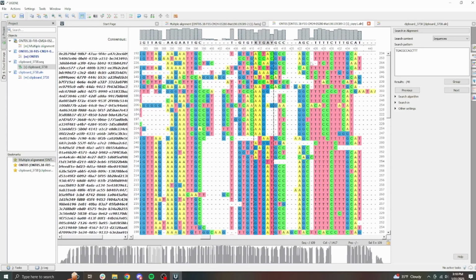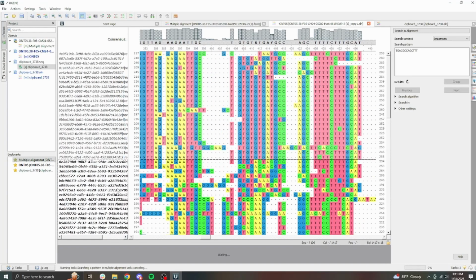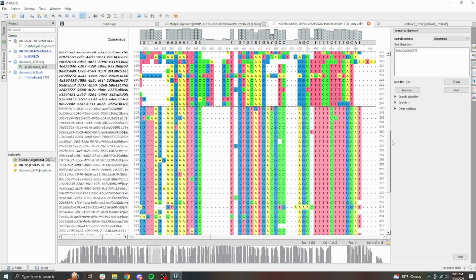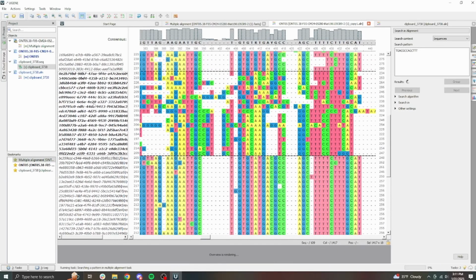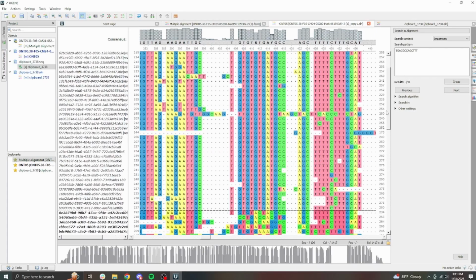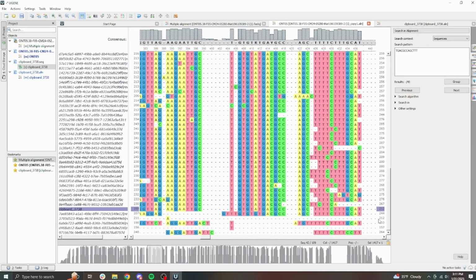Sometimes it ends up with a situation where there's some extra noise at the top, so not everything aligned perfectly properly, like there's some noisy sequences in here. And that's okay, because Nanopore works off of a consensus of multiple sequences, so that if some of them aren't quite right, it isn't going to throw the entire thing off.